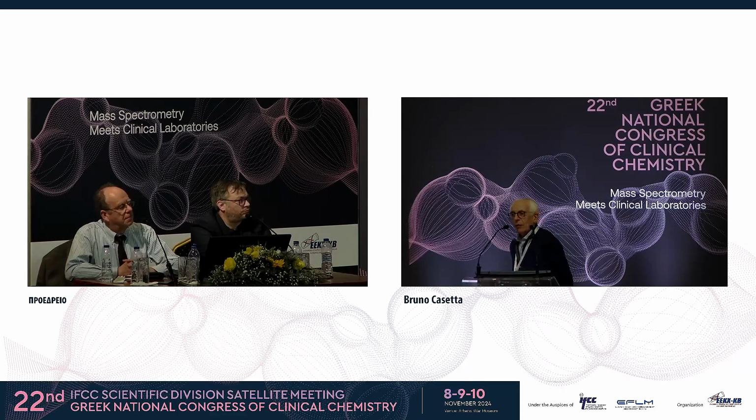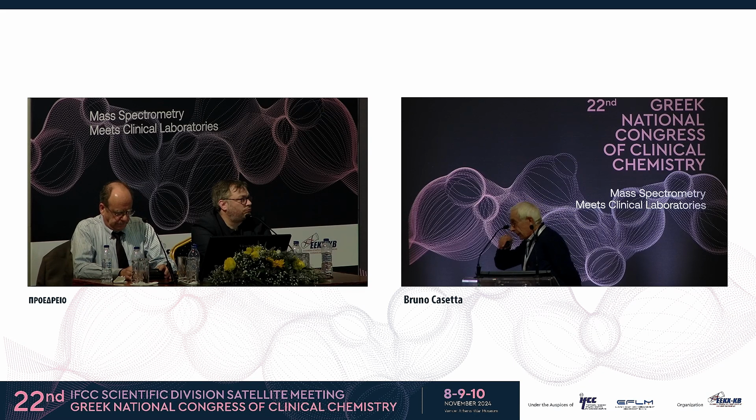Now, with the iTRAQ you used, you remember, it was delivered in a very small volume, okay? Here we are not facing this problem because we are speaking about human volumes to be handled. So the reagent is different. And in the case of the iTRAQ, the only comment I can make, because I have worked a lot on that, is the humidity of the derivatizing reagent, which was dissolved in acetonitrile. Here, of course, the reagent is in acetonitrile as well.